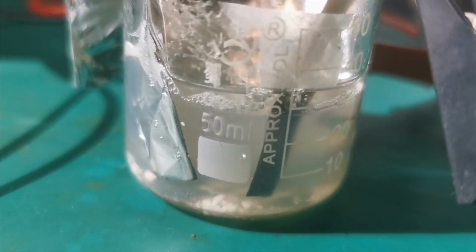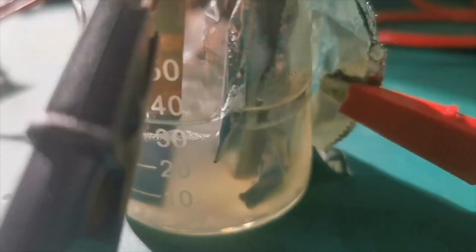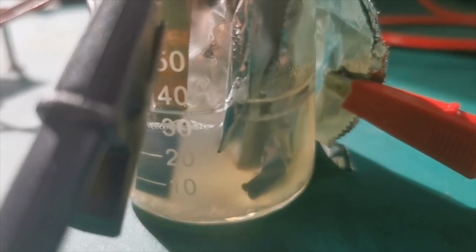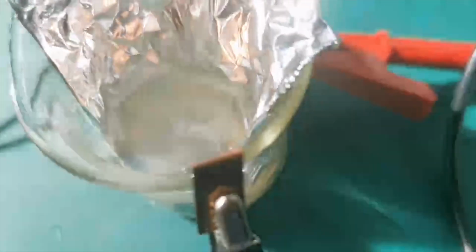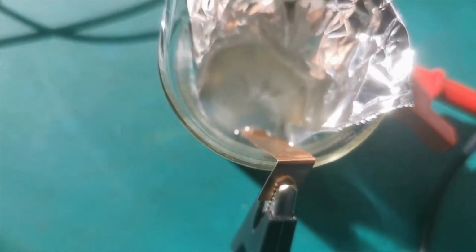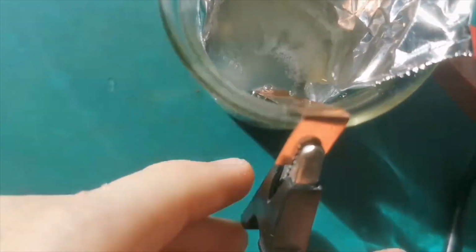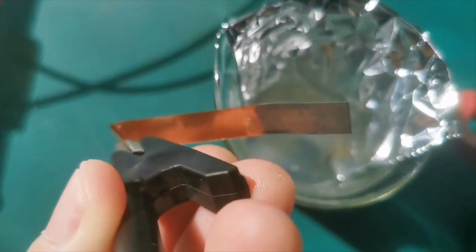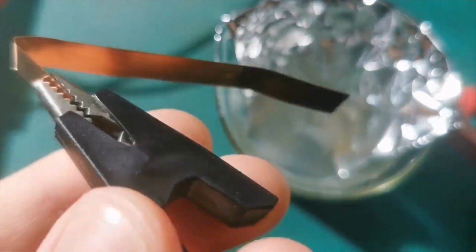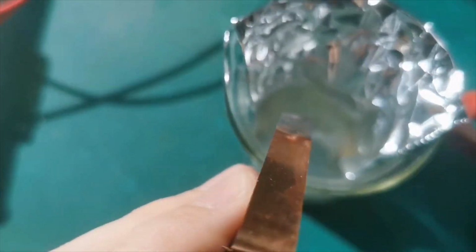Obviously, if you have anhydrous aluminum chloride, you can add it prior to the reaction and produce lithium fast from the start. However, anhydrous aluminum chloride isn't easy to get for everyone, and it is rather difficult to handle, so I came up with this in situ generation method instead. Still, because of the very limited solubility of lithium chloride in PC, the reaction is still going to go very slowly at first, until enough aluminum chloride is generated and the speed picks up.